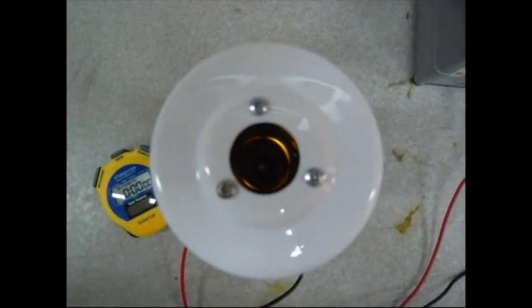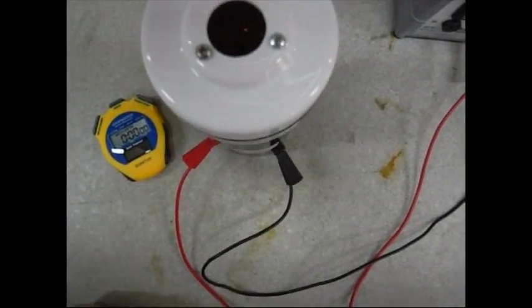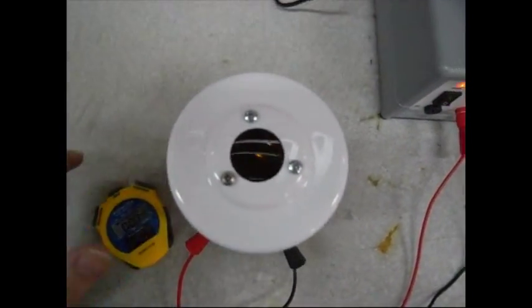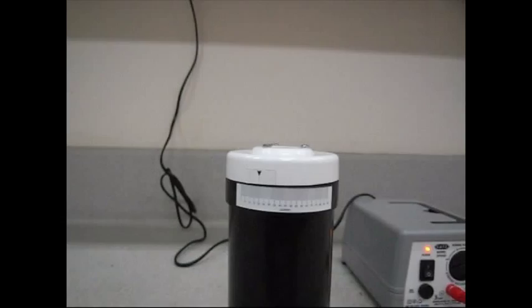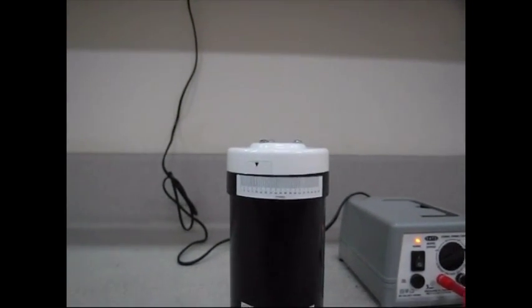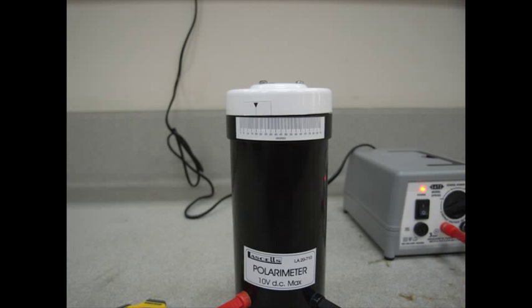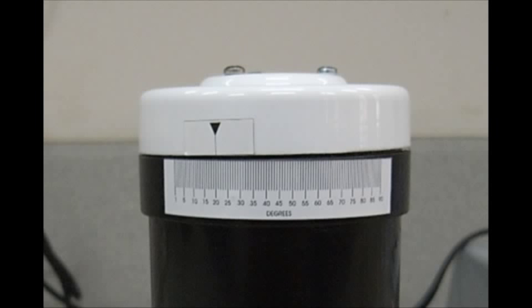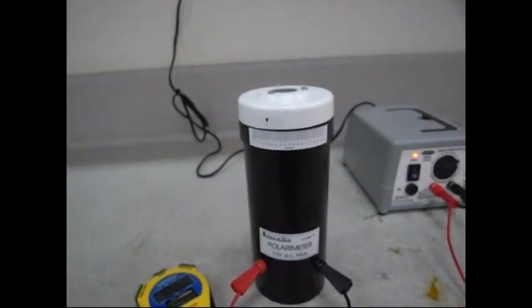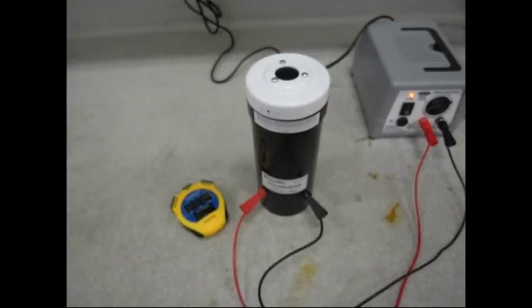That's the correct reading and we can start the stop clock there. That reading is about 20 degrees on the polarimeter — 20 degrees to the right.